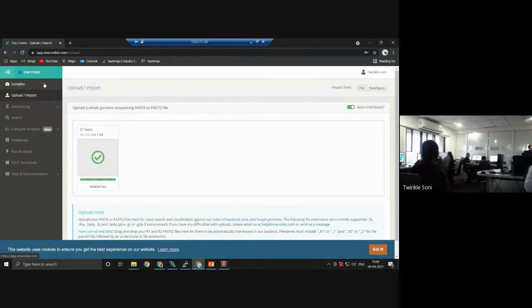Like this many resistance genes, and this many number. The downstream analysis, the representation for your papers and for your work, will be shown by Dinesh sir in STAMP. You can do analysis in STAMP as well. But in OneCodex, they will do the analysis, and they will even give you a graphical representation of it as well.